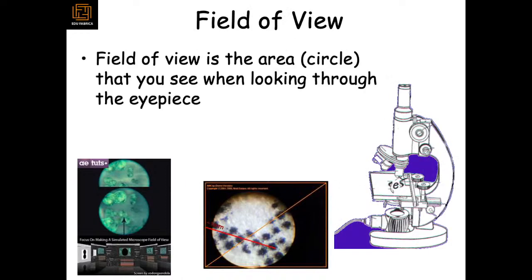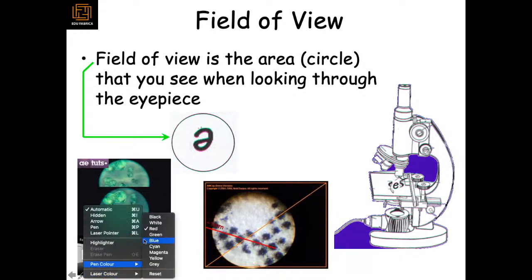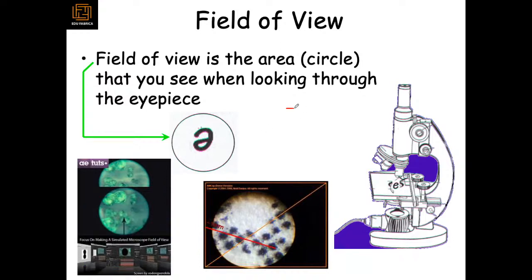So how does the image look in these microscopes actually? The field of area in the circle is what we see through the eyepiece. If an E is written like this, we will see the same thing upside down and as a mirror image.